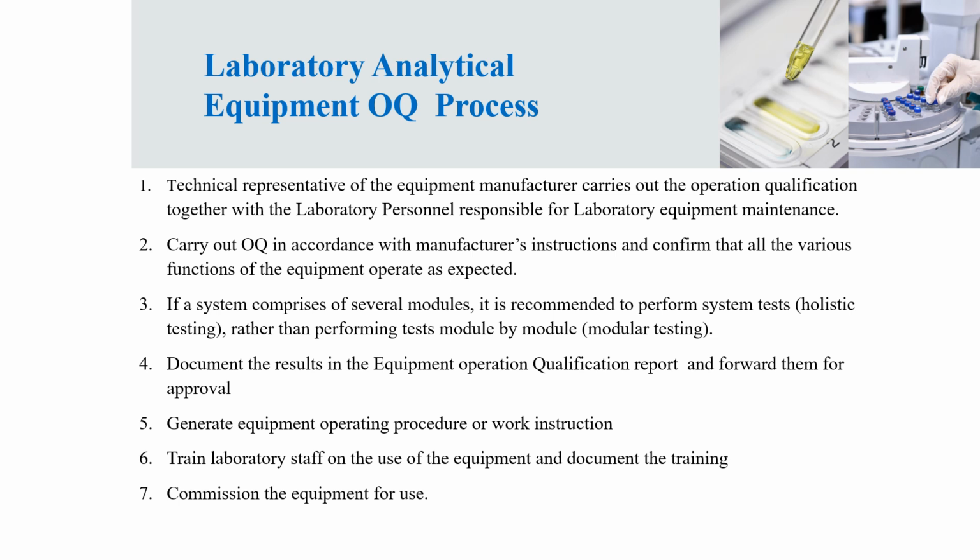Document the results in the equipment operational qualification report. Generate an equipment operating procedure or work instruction. This is a document that is going to be useful for the users of the equipment in their day-to-day operation of that particular equipment. Train laboratory staff on the use of the equipment and document the training.